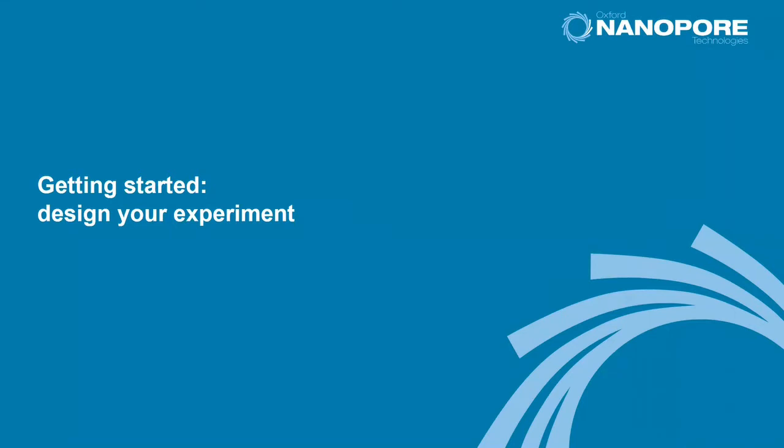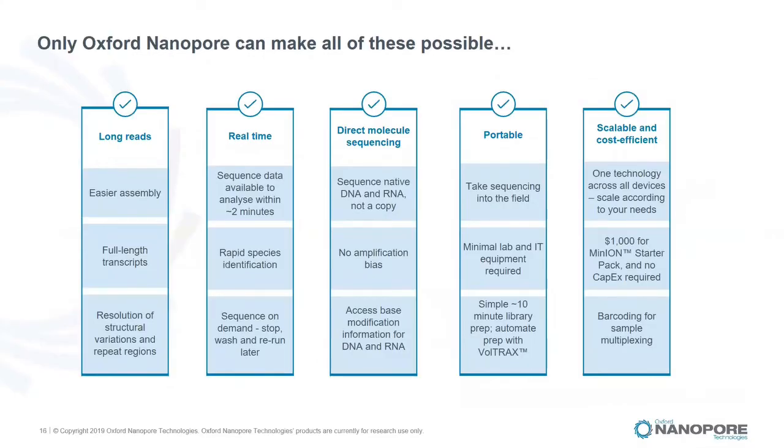So I mentioned several good points of nanopore sequencing. What applications can you apply? We have really long reads, like 40, 50, some reads even like 100 kilobases. Very long reads are good for assembly and full-length transcriptome, and definitely de novo assembly is very helpful. And real-time infectious disease pathogen detection, where you can review your sequencing in real time. And single molecule sequencing is definitely helpful, for DNA or RNA molecules and modification as well, and it's very portable. You can sequence literally anywhere. And it is scalable and cost efficient.